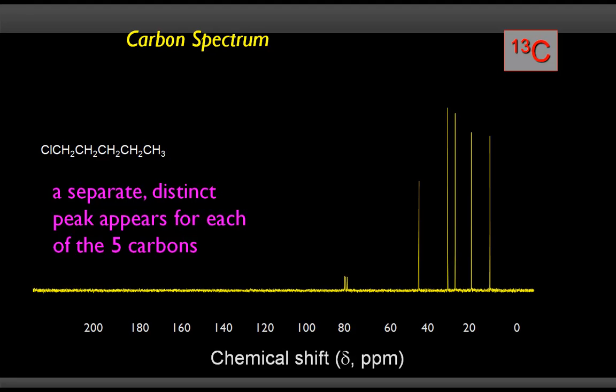because it's not like hydrogen anymore. There is some relaxation delay. You remember we get the peaks because of their relaxations. When they relax back to the alpha spin state, they emit the energy, and we record that. If all the nuclei are not relaxing at the same rate, there is a discrepancy in their peaks, right? That's one of the reasons why the integration is not very useful in carbon NMR.